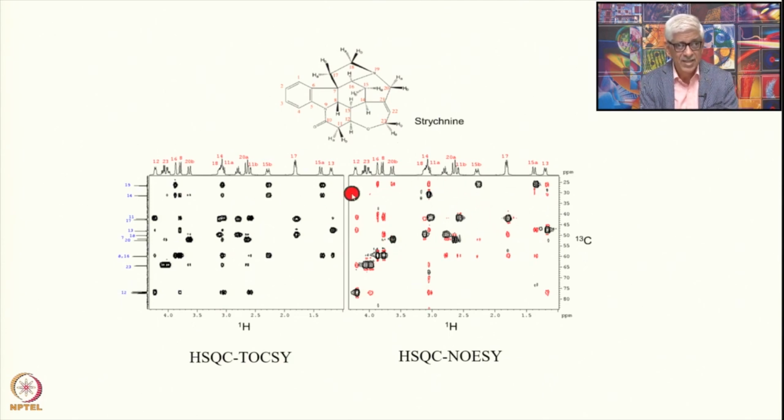Now at the same carbon positions, you see the TOCSY. So you have the whole range of protons which are attached. From here to here there are so many protons which are connected to that. You have different carbons there, and from the carbons you have a relay to the protons which are attached. Therefore you can identify the protons which are connected to these carbons. You see here these are the ones which are connected in the coupling network. You can look at these peaks to see which ones are connected. The numbers are indicated here.